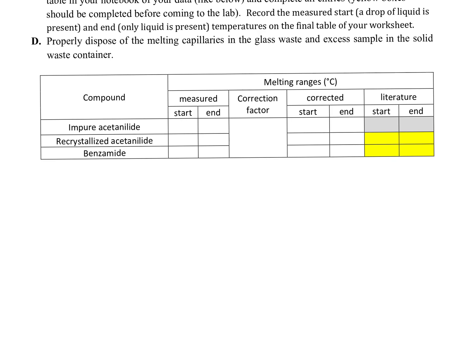And we use the melting point or the melting range of the compound, and we'll probably use those terms interchangeably. It is a range technically, but we sometimes call it the melting point. But we use that to get an idea of the purity of the compound. If the melting range of our compound matches what people have reported in the literature, then we probably have a very pure compound. If we're slightly lower, then we might have some impurities. If we're very much lower, then we probably have a significant amount of impurities.